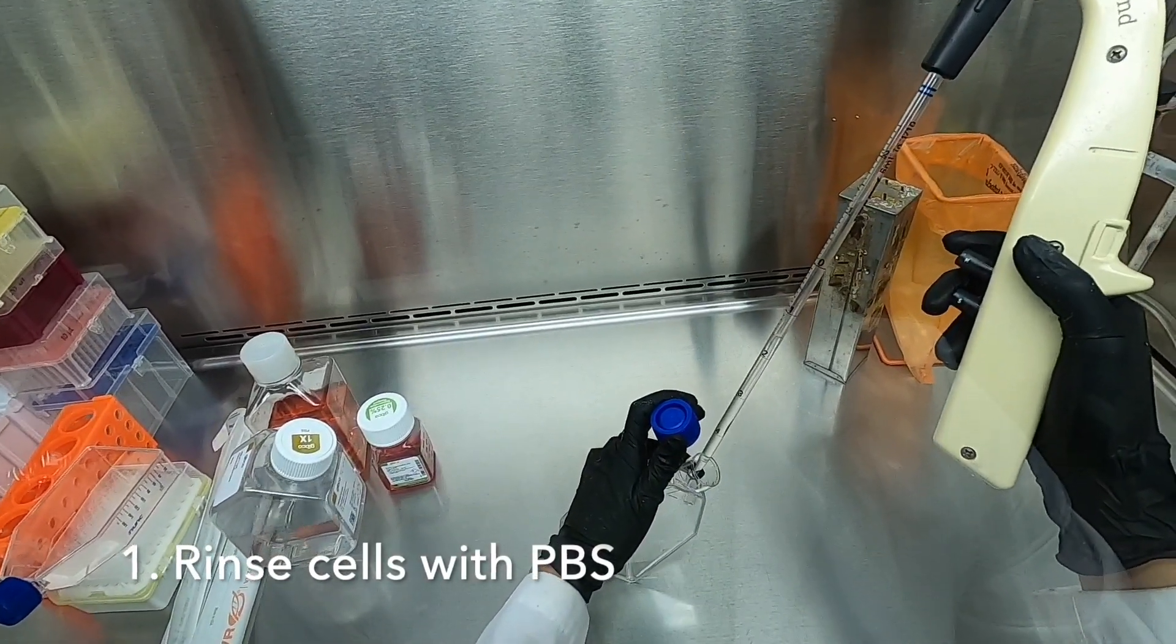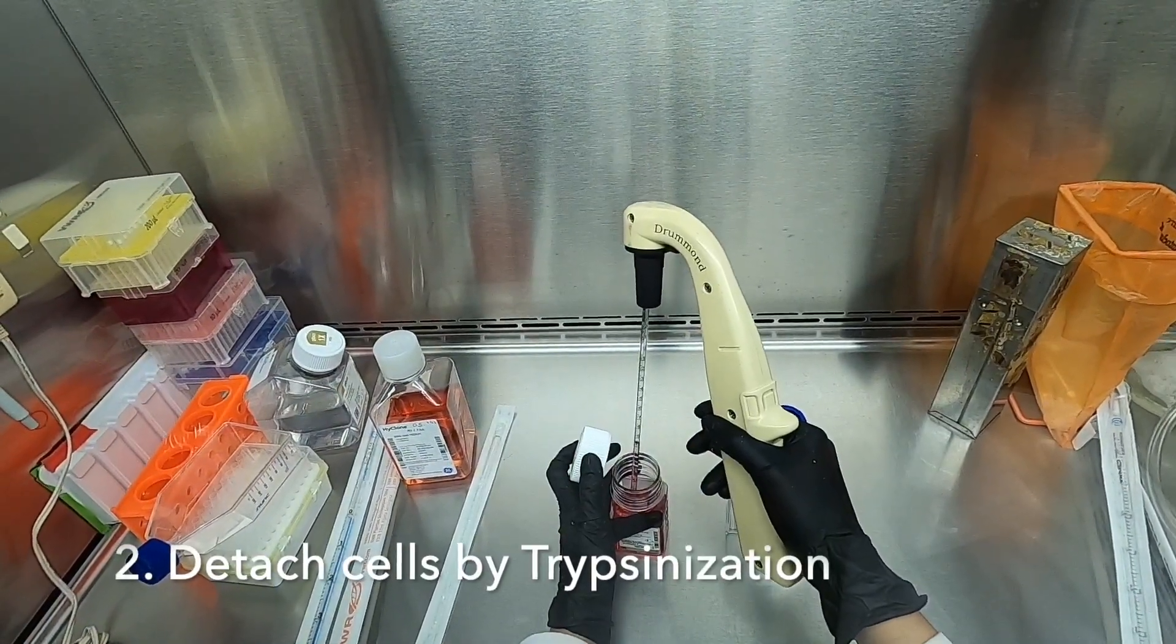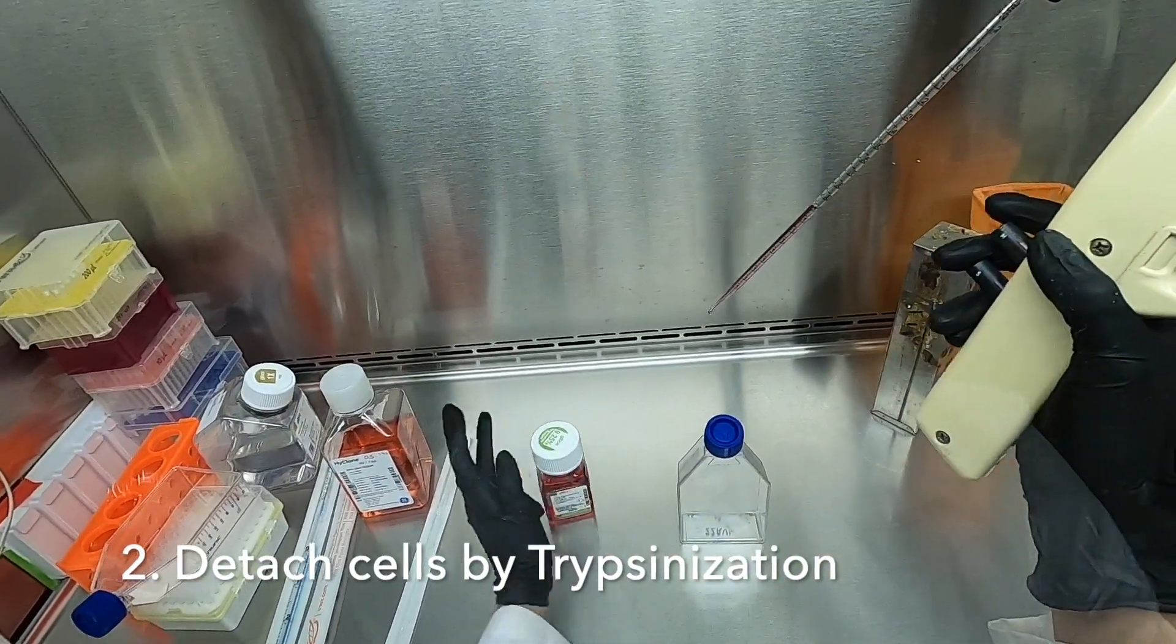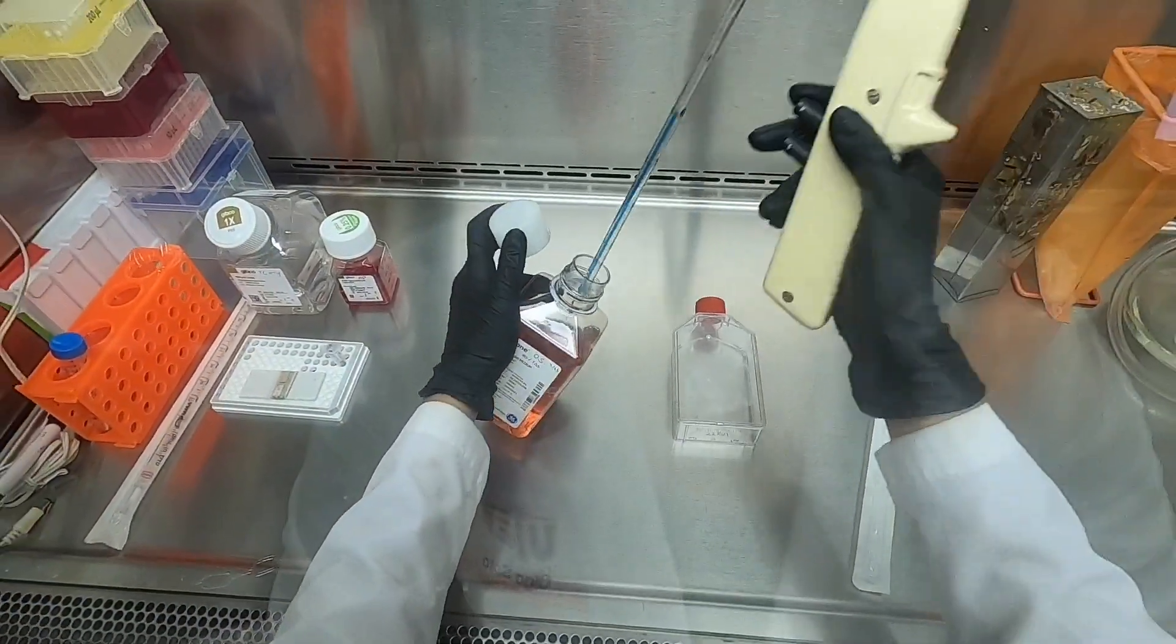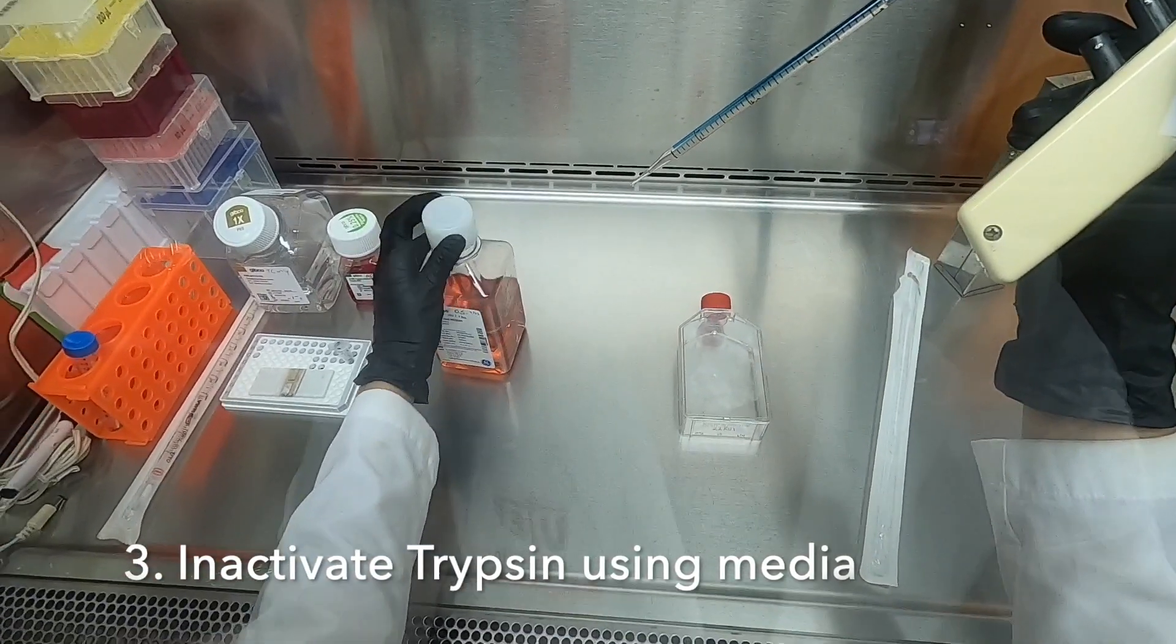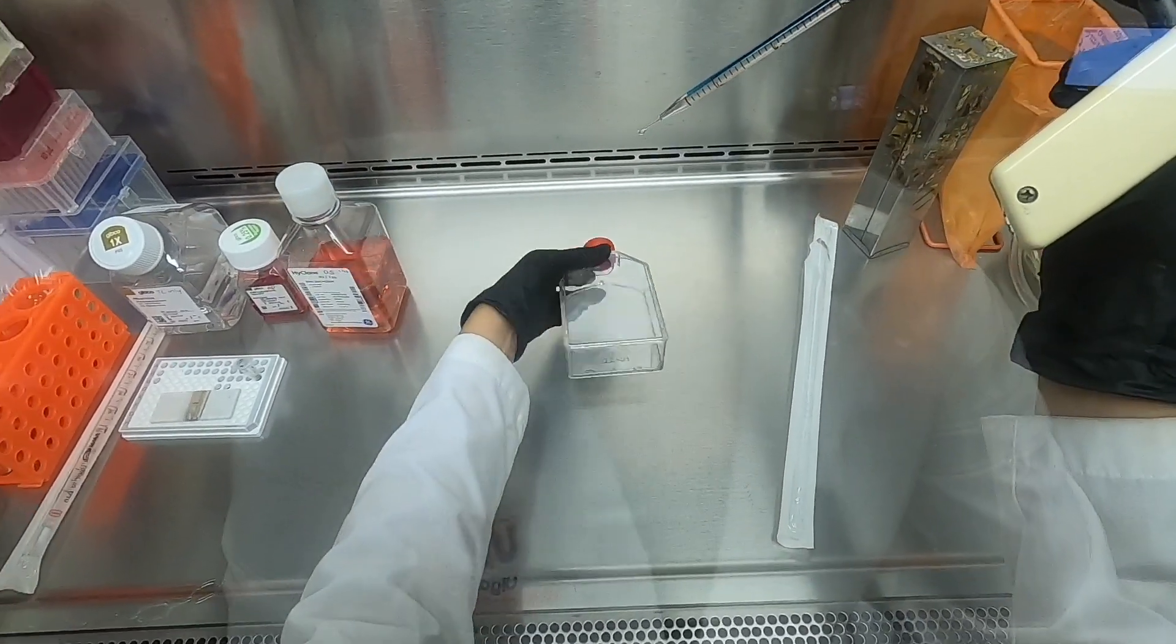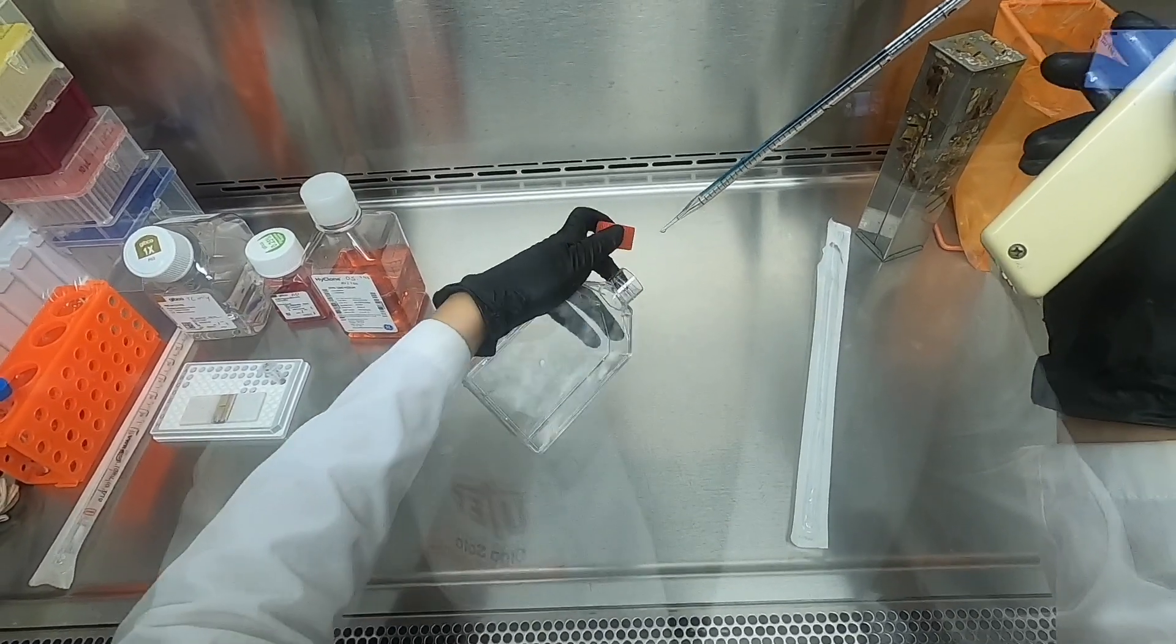Briefly, we first rinse the excess FBS and media from our flasks. We then proceed to trypsinize our cells in order to detach from our flasks. Then we inactivate the trypsin using complete media containing FBS, making sure that we achieve a single cell suspension.